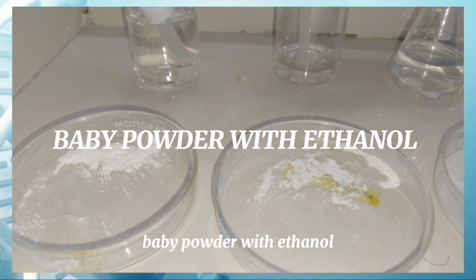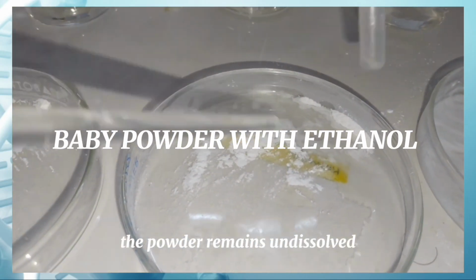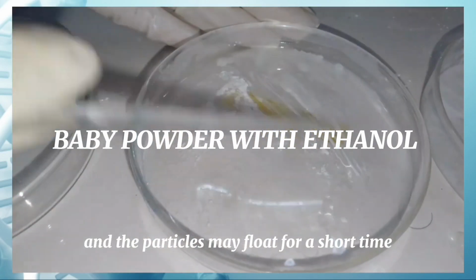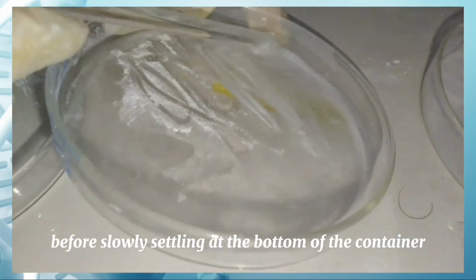Baby powder with ethanol. When baby powder is mixed with ethanol, the powder remains undissolved. The texture appears milky or cloudy, and the particles may float for a short time before slowly settling at the bottom of the container.